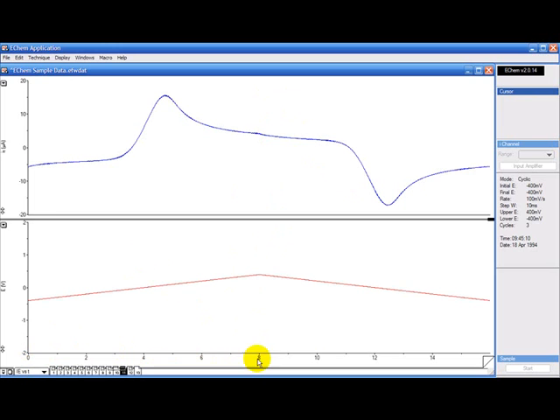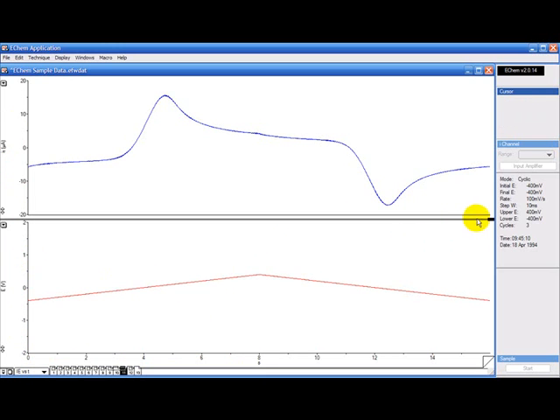On the x-axis we have time, here we have the current, here we have the voltage. I don't need to see the voltage so I can hide it like this.